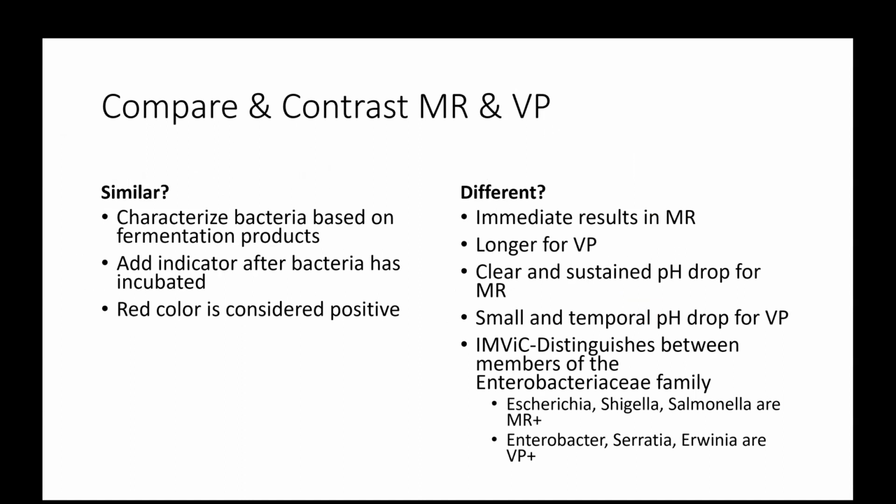There'll be a lot of questions on your second lab practical that will compare two different tests. For example, I might ask what the differences are between the methyl red test and the Voges-Proskauer test, and why you would use one as compared to another.